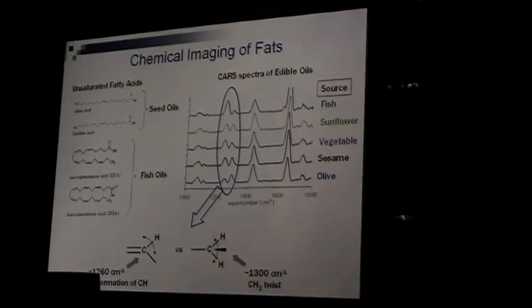So we lack an imaging technique that can look at a healthy cell or a cancerous cell or some problematic cell and see the ratio between good fat and bad fat. The difference between these fats is basically the composition ratio of double bonds and single bonds, right? And there's no way you can label this with fluorescence. Fluorescence will just tell you that you have oil, that's it. How can you do it?